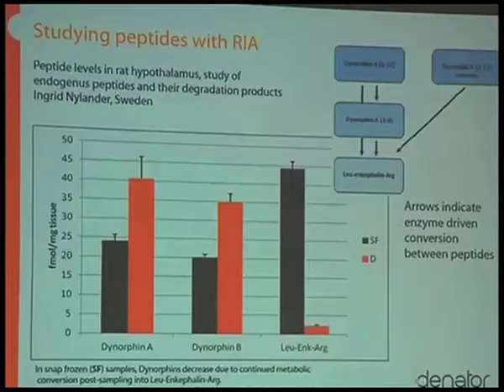It's important to illustrate these samples. They're rapidly frozen. From a frozen state, they're dropped into boiling 1 molar acetic acid, boiled for 5 minutes, and then extracted, and then the extract is again heated to 95 degrees for 1 minute. That's the snap frozen, the standard workflow that they use for these samples.